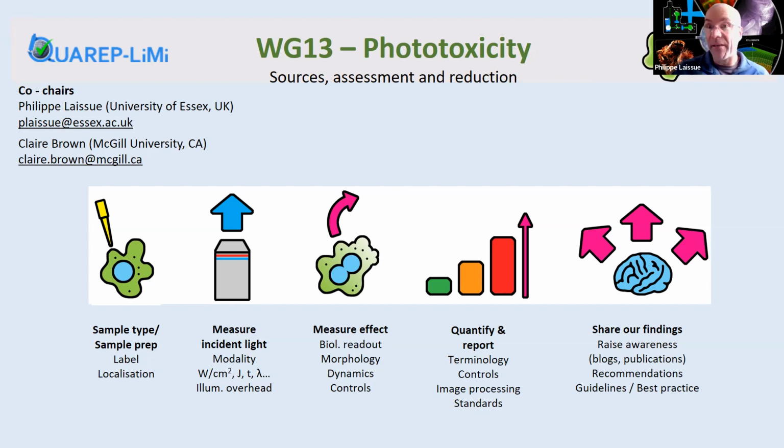The terminology is important. We want to agree on a unified set of terms that we would recommend, generally recommendations for controls as well, and how can image processing, for example, also deep learning, be used to possibly further minimize phototoxicity, and are there some kinds of standards that we can recommend? Of course, we always then seek to share our findings.